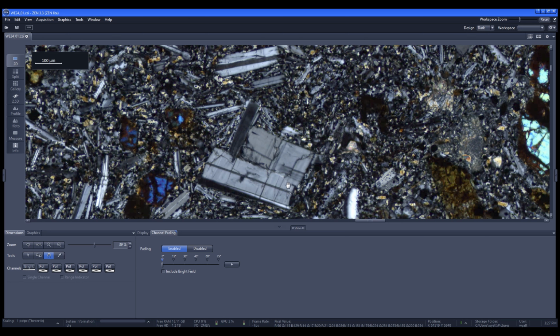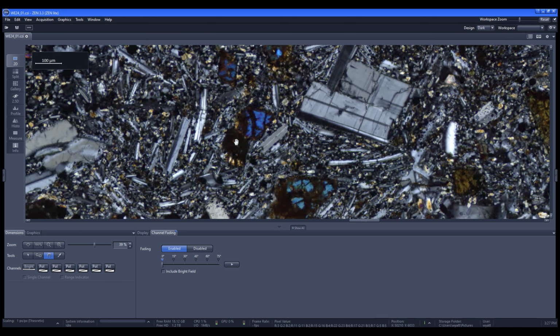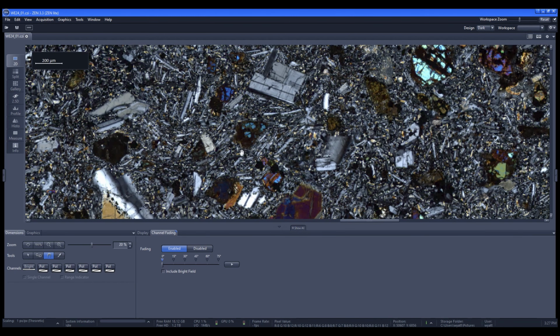It's just a basic classification for the feldspar. It doesn't really tell you what kind of plagioclase it is. What controls the composition of plagioclase is that one is more sodium-rich, and one is more calcic, so calcium-rich. Depending on that percentage, you're put into a specific field on a certain chart for identification.